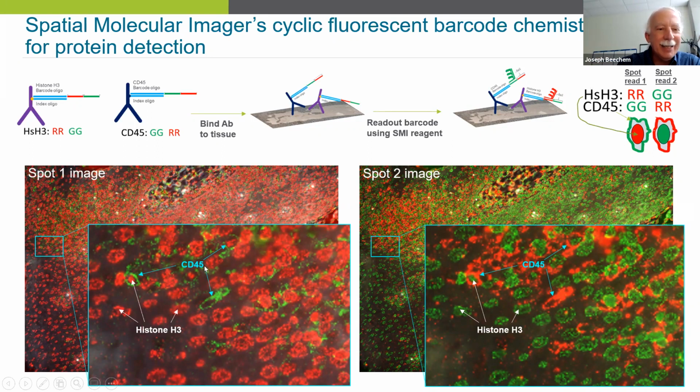Then I can set it up as I cycle my reagents. I can spin that backwards, and now all of a sudden the signal that was green now turns red. The color doesn't map, it's mapping a target, but how we cycle them and how we encode that information each involves multiple colors. So it's not like one color stays in one place.